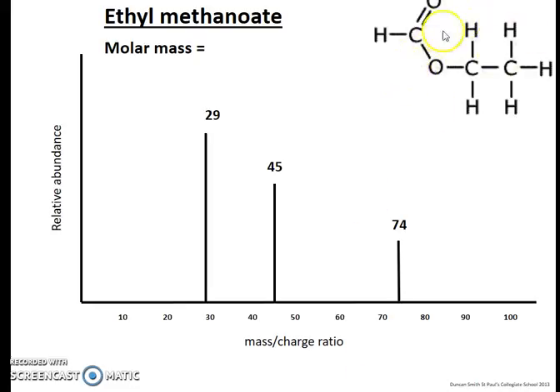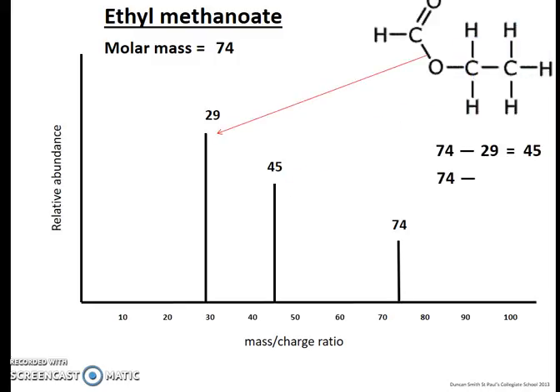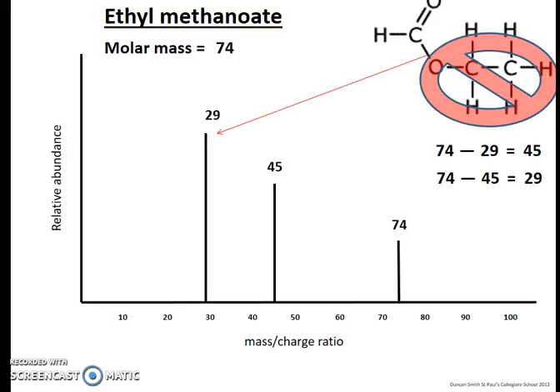So through this fraction here, if you can see where my cursor's going, I don't know if you can or not, that's a common fragmentation point for an ester. It can give you some idea about the masses. You can also obviously get the loss of your alkyl chains. And you get those fragments forming.